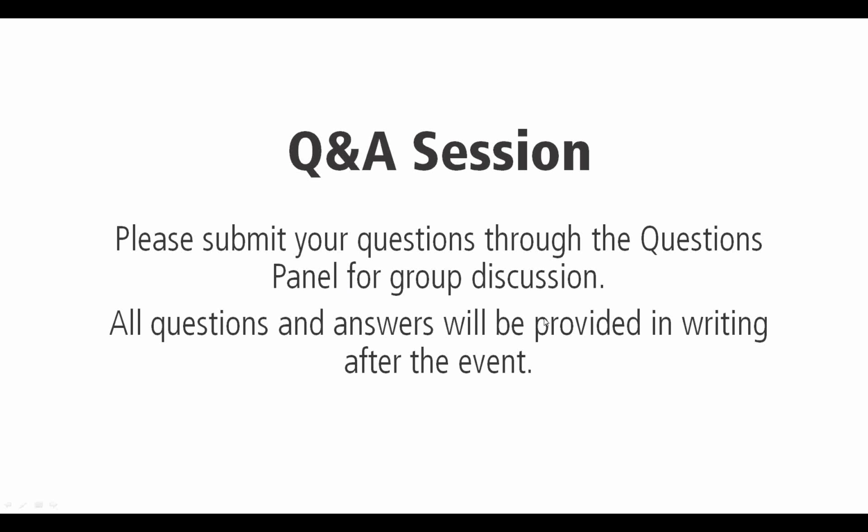Excellent. Very good. Oh, sorry, continue, Andy. I'm going to jump in with a couple more questions. We have one specific question about ECG filtering within the device. I would imagine that if anyone really wants to see this happen, the best thing to do is arrange an on-screen demonstration, which I'm sure, Graham, you'd be happy to do. But if you could describe briefly the process and what options are available through the mouse monitor directly for ECG filtering.